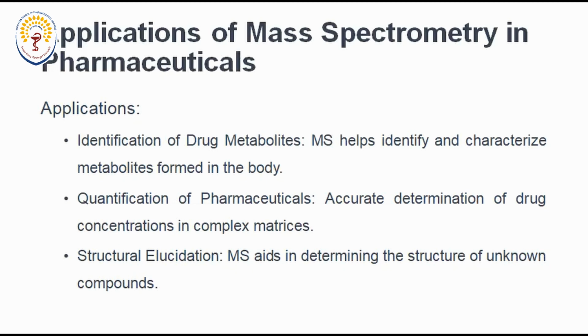Now, what are the applications of mass spectrometry? They can be used to identify drug metabolites. See, mass spectrometry has only one thing, one piece of information to give.